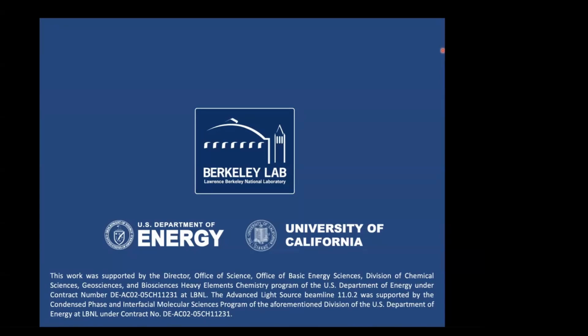So I'm interested in whether you attempted or considered just measuring electron yield of the fluorine K-edge as opposed to STXM, and why that is not the method to go with.